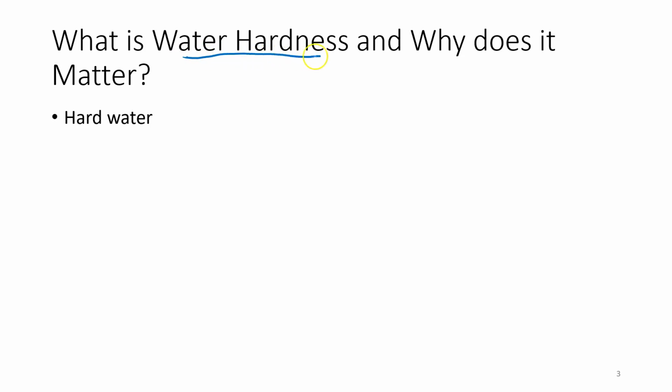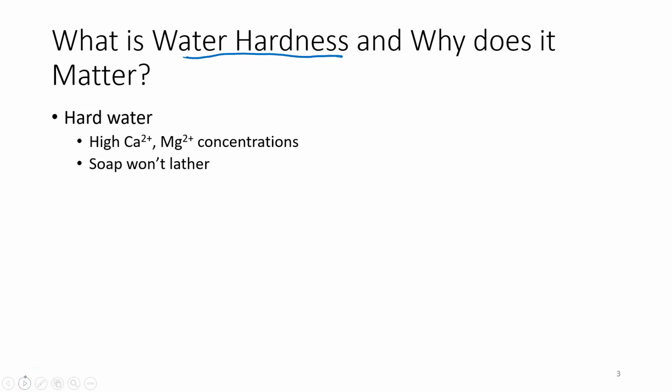So why do we even care about water hardness, and what is it? Well, hard water has elevated calcium and magnesium concentrations. And why is that bad? Well, basically it binds to soap and prevents it from doing its job. Here's a chemical equation demonstrating that.